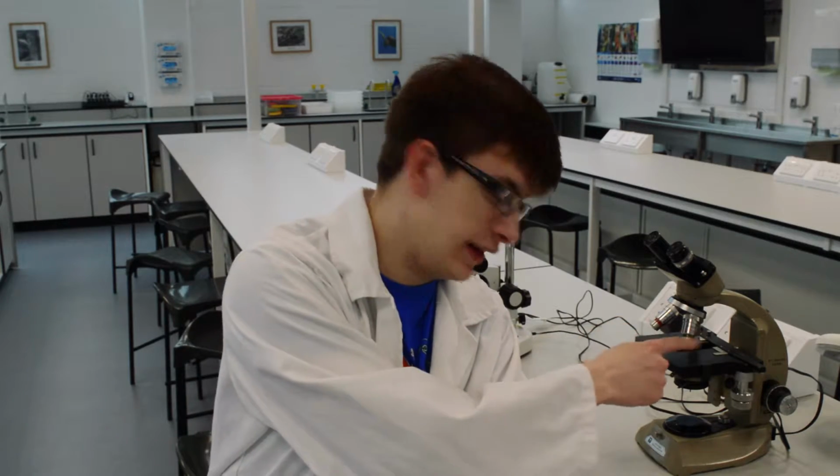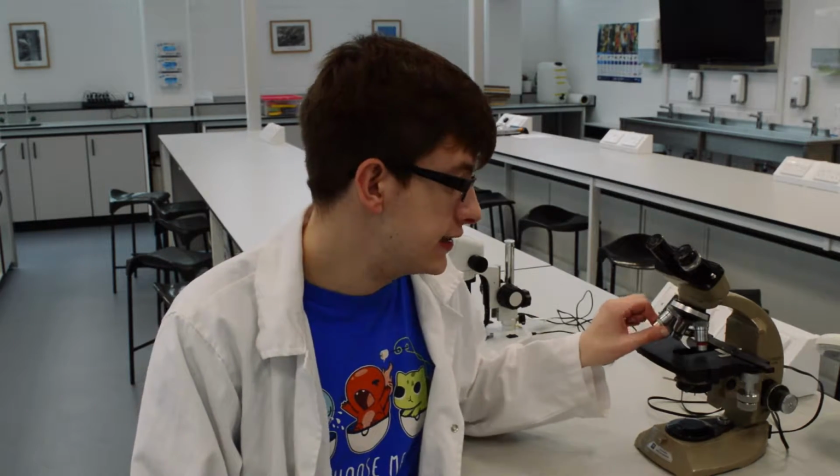Microscopy, simply put, is the study of microscopes. Microscopes use magnification in order to make smaller things appear larger, using things called lenses, these little coloured things right here. Using different lenses will give you a different quantity of magnification. For example, on this microscope, there's 10 times magnification, 40 times magnification, and then 100 times magnification.